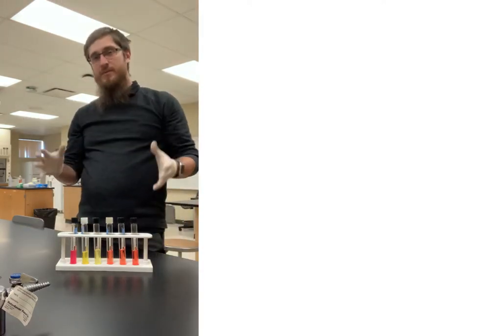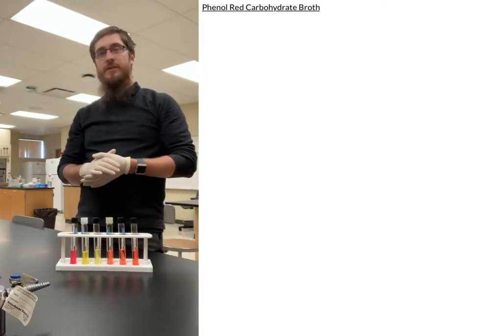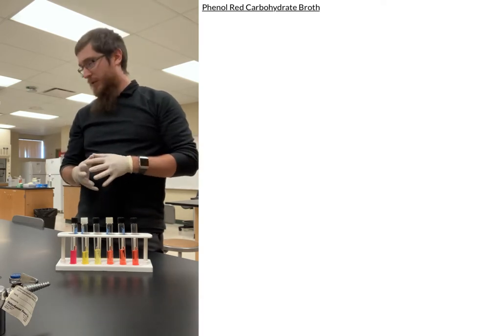Hi guys, today we're going to be talking a bit about the phenol red carbohydrate broth that we're going to be using in the lab.